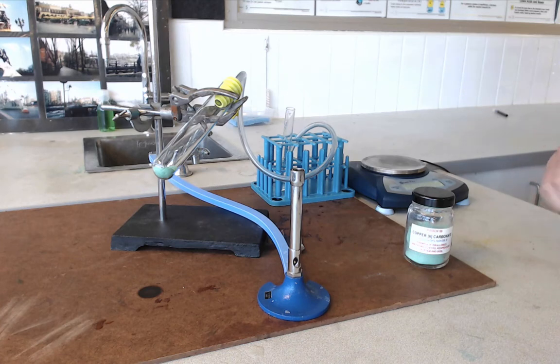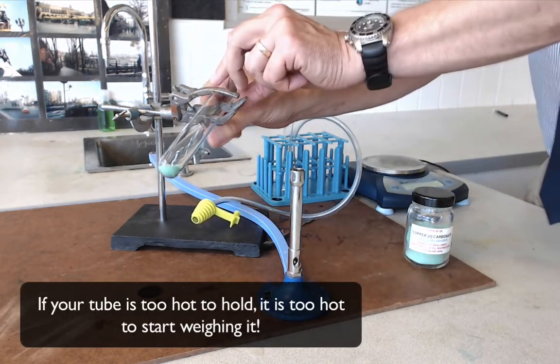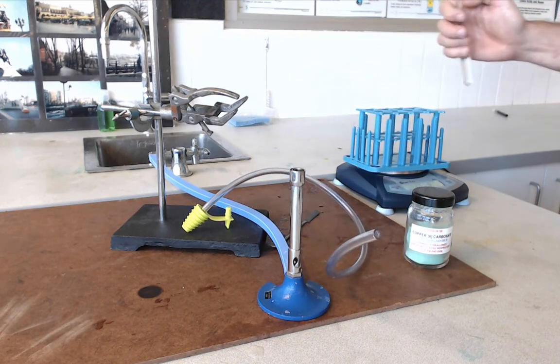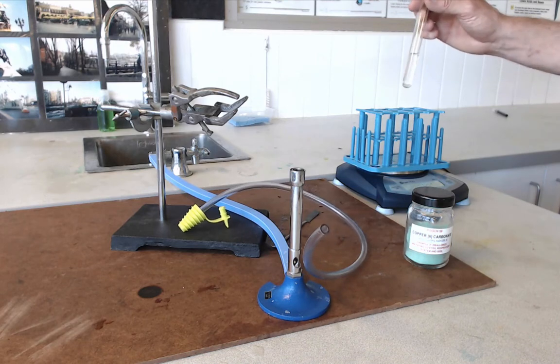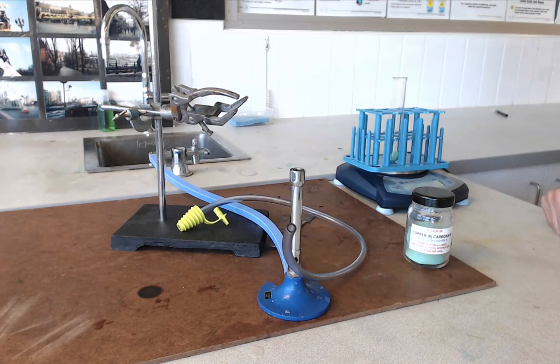Let everything cool down and take everything apart. The last thing to do before packing up is to weigh the two tubes again. Put the test tube rack on the balance, weigh the test tube, and record that mass — so you now know what the lime water weighed before and after. Also weigh the solid so you know what it weighed before and after. Enter those values into your table and you have all the results you need.